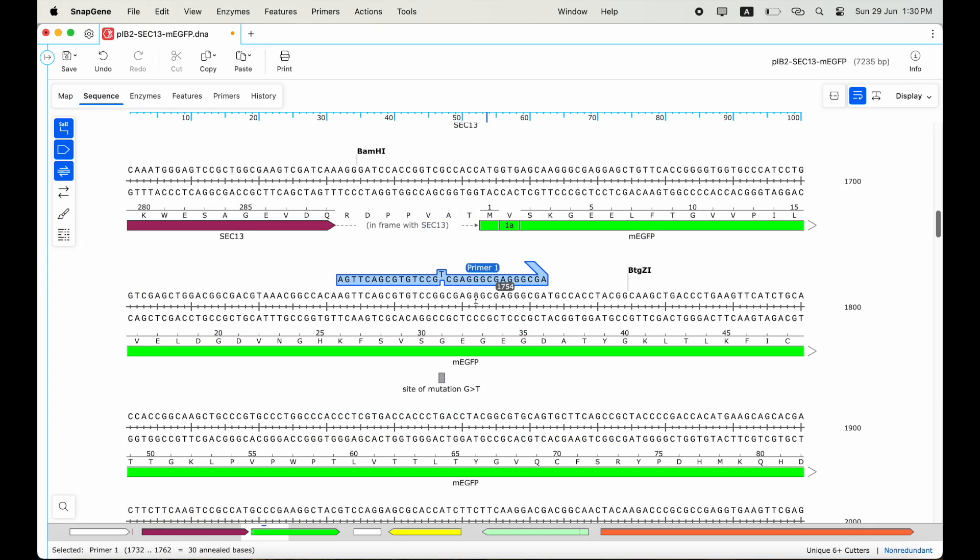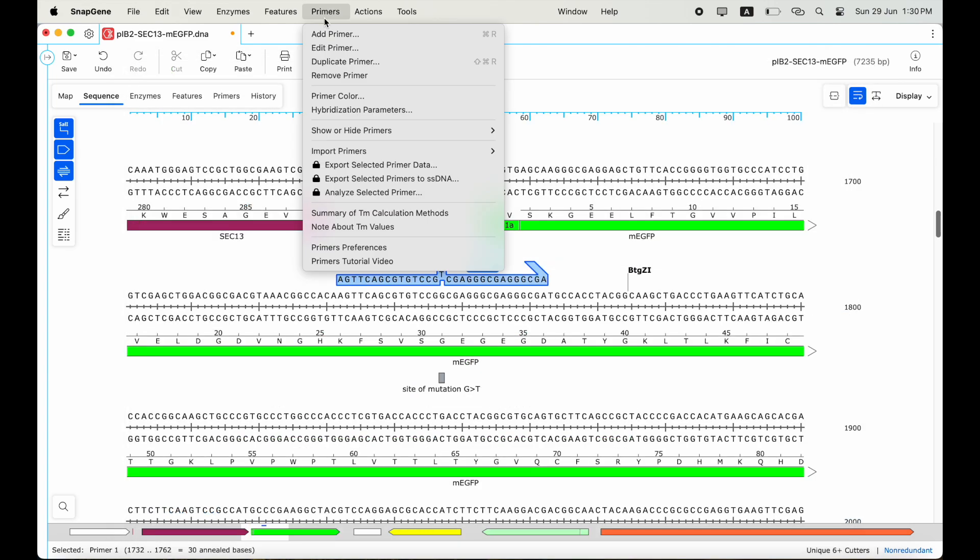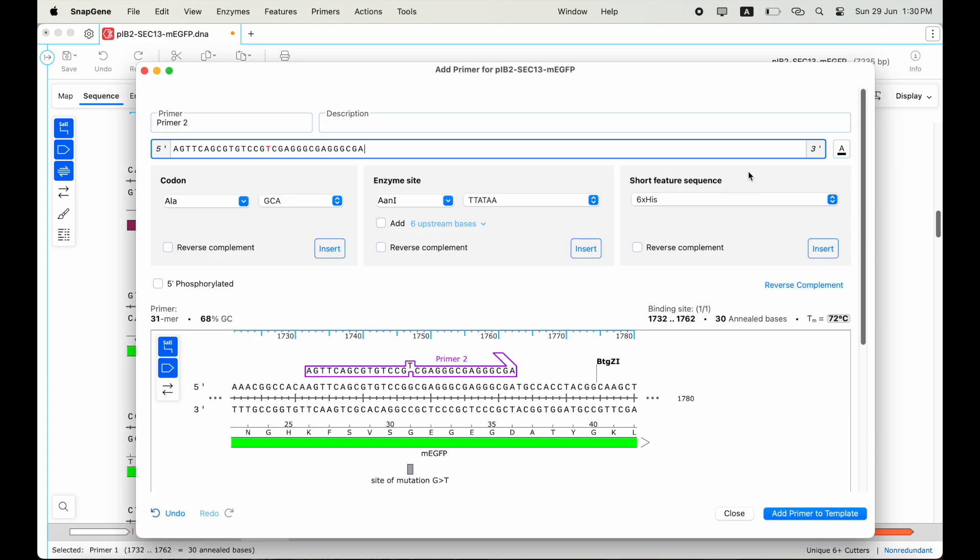Next, I need to add a complementary primer to the one I just created. I will copy the top strand primer, close this tab and add new primer, then select reverse complementary. And it's as simple as that.